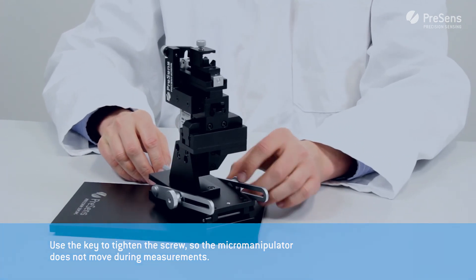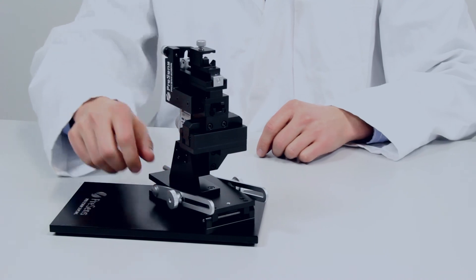These are the different ways how the manual micromanipulator can be adjusted to your measurement setup.